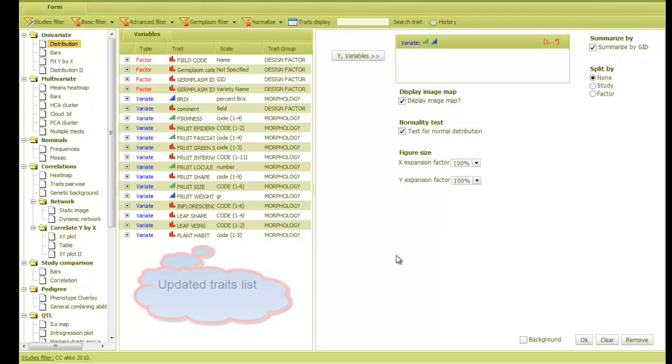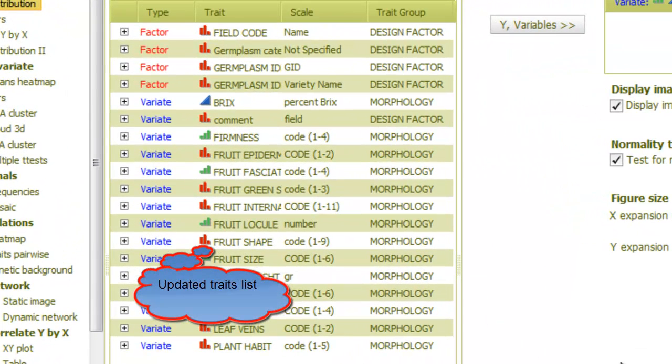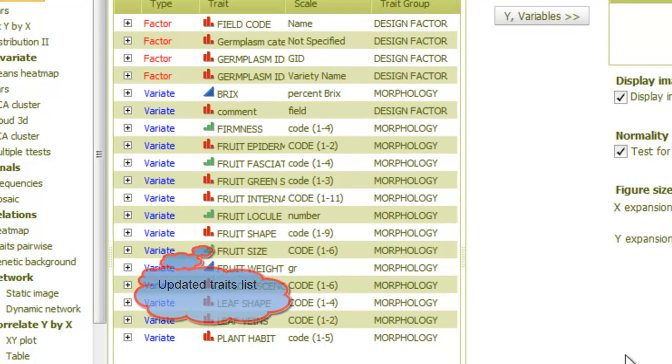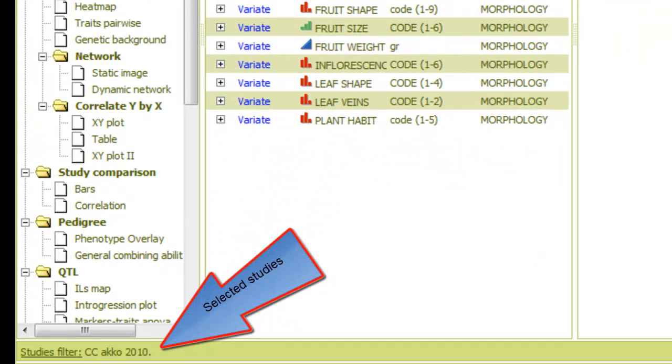Now the traits list is updated to contain only traits that were measured in the selected studies. Also, the status bar indicates the name of the selected study.